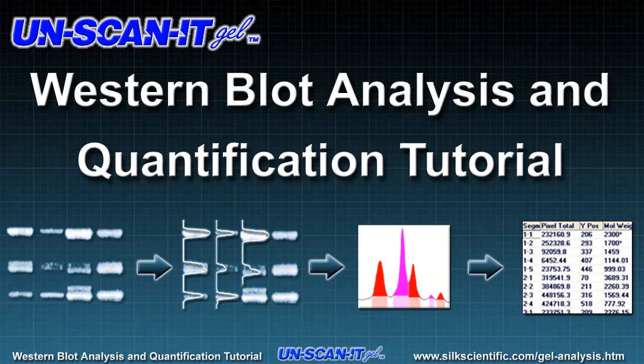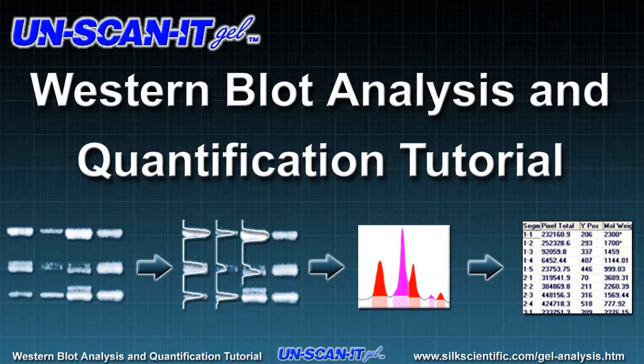Welcome to the Western blot analysis and quantification tutorial for the UnscanitGel software. This tutorial will step you through the process of analyzing and quantifying a Western blot image using the UnscanitGel software.